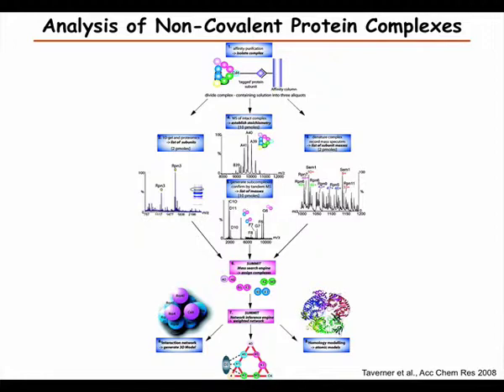And then the idea here is to put this all together and build some kind of interaction network. So at least which one interacts with which. And these are, of course, not that detailed models, but still, one can find subcomplexes, and one can see by combining all this information which ones are closer to each other in the complex. So one can start building up how these complexes are built.